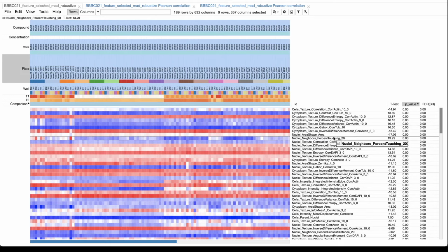Now, eventually, we start getting some nuclei features, but we really do have quite a mixture, and that's why sometimes doing these marker selections can be a little bit unsatisfying, because even in a case where we have a strong sense of what we think the features ought to be, it's not always necessarily what actually is driving this.